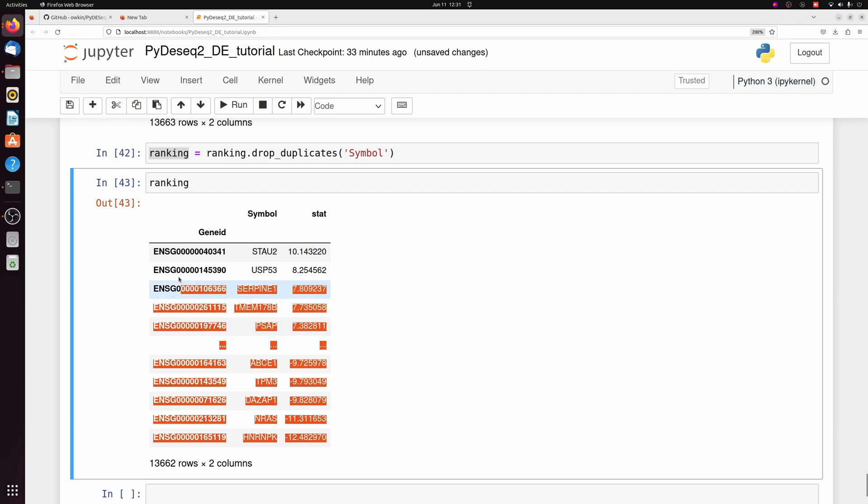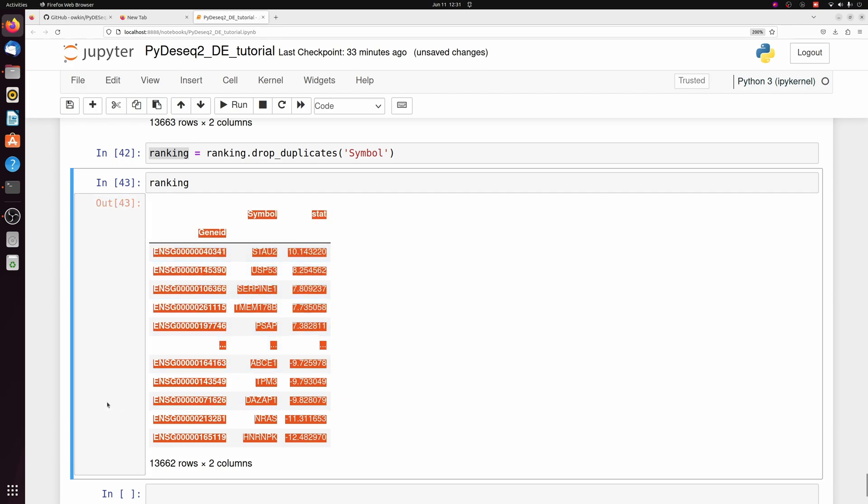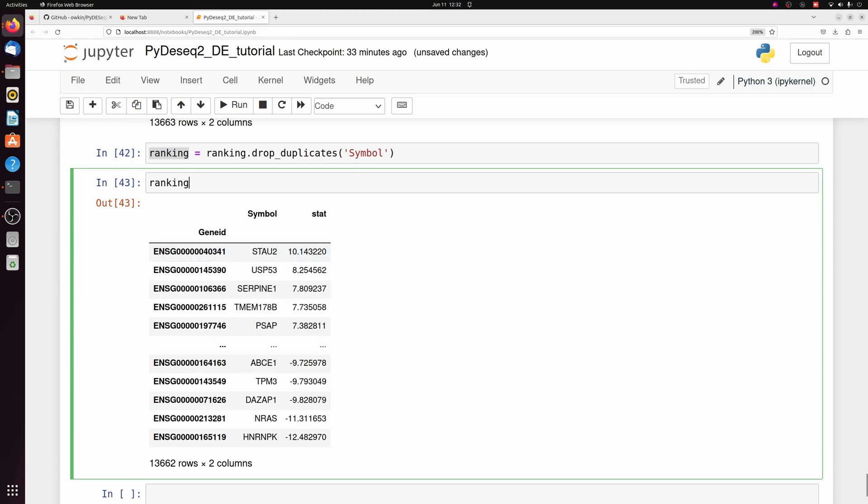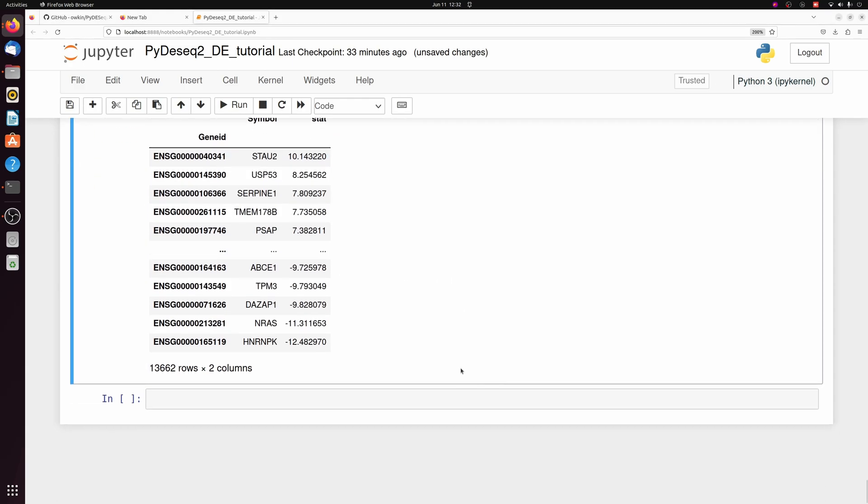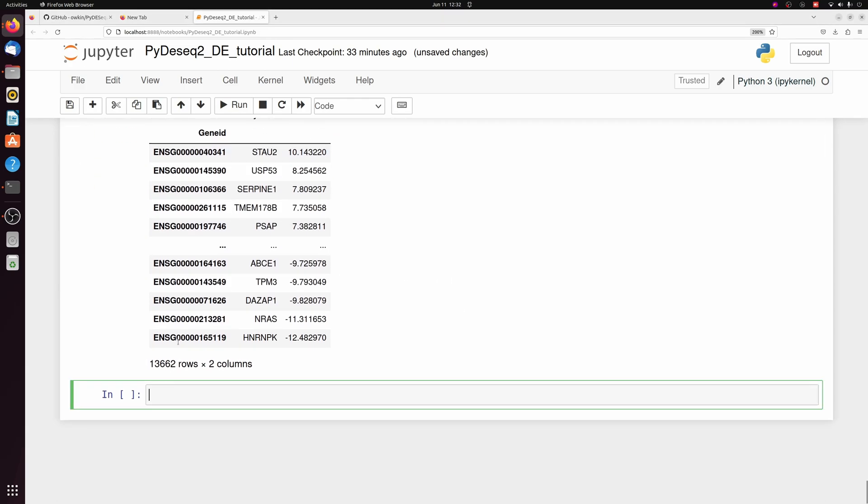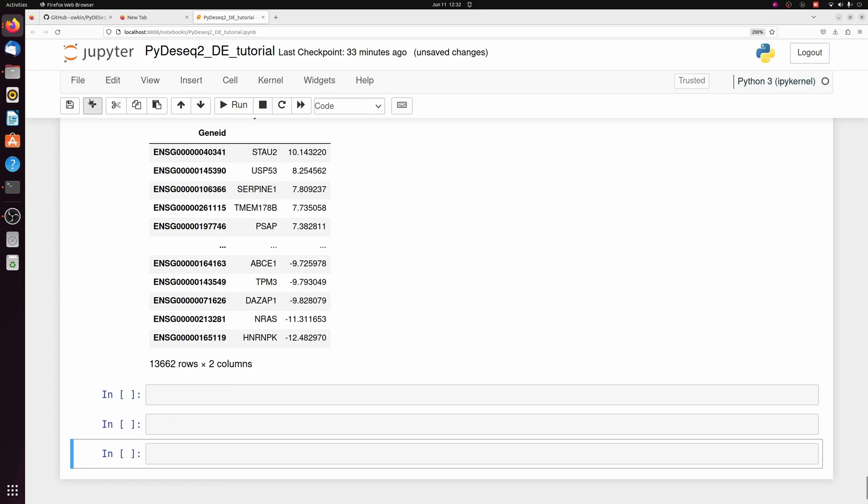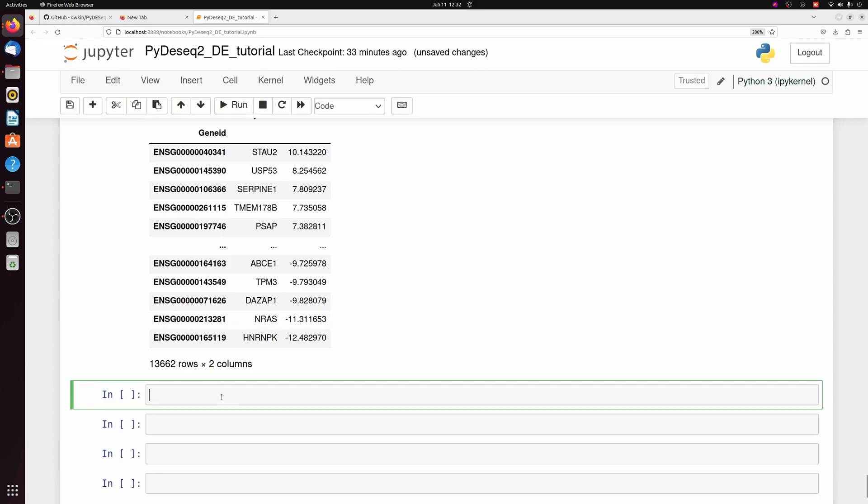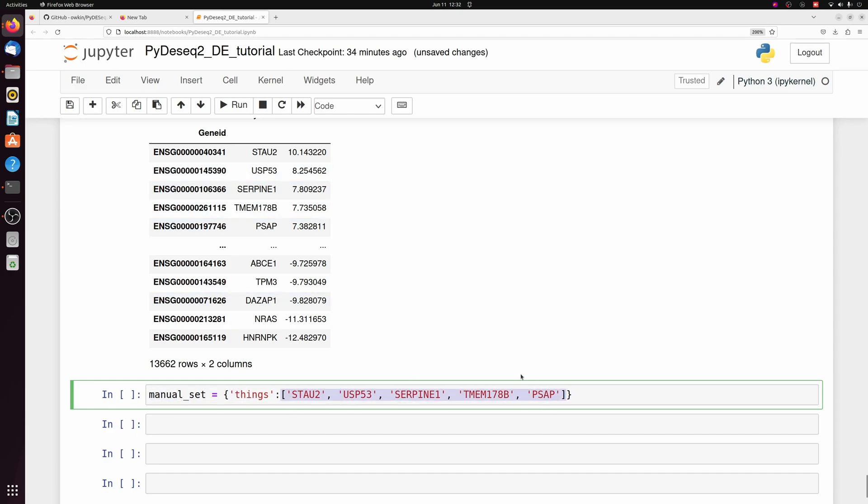So now that we have this ranked data frame, we can run GSEA. I'm going to use the gene ontology database. But just as a quick example, you can add your own manual set of genes, too. So I'm just making a toy gene set called things. And you can put it in a dictionary. So you can have multiple terms in one dictionary. But this is just one. I'm just picking the first couple of genes here for fun.